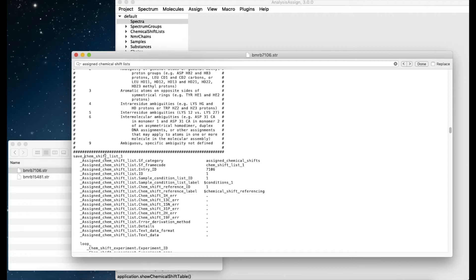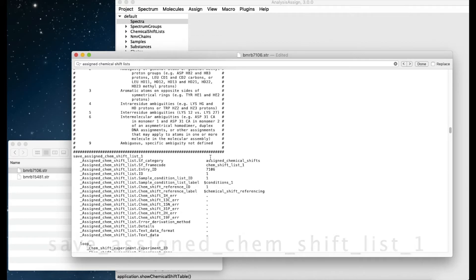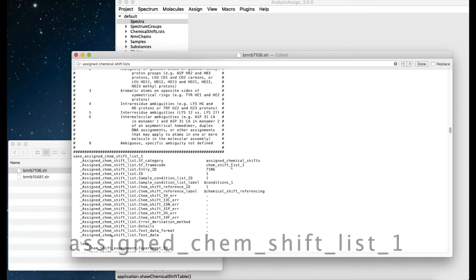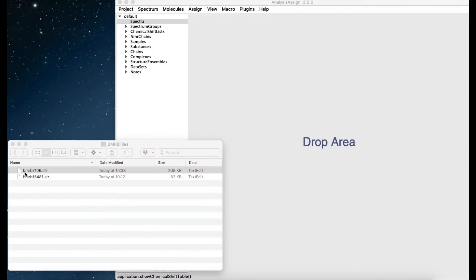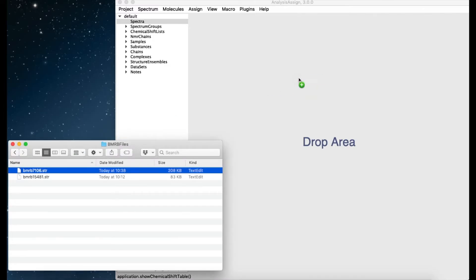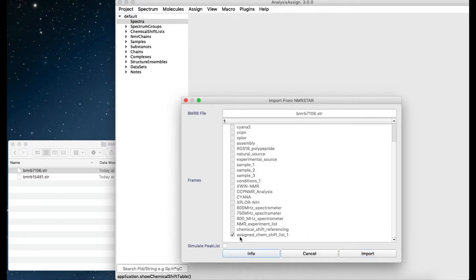The Save line needs to become Save Assigned Chem Shift List 1, and two lines down, SF Frame Code also needs to become Assigned Chem Shift List 1. Save your file and now when you drag it in, you should get an Assigned Chemical Shift List line with a tick by it, and you can do the import.